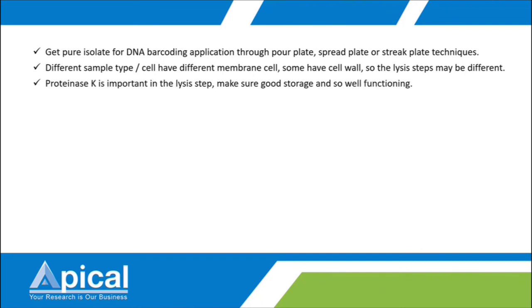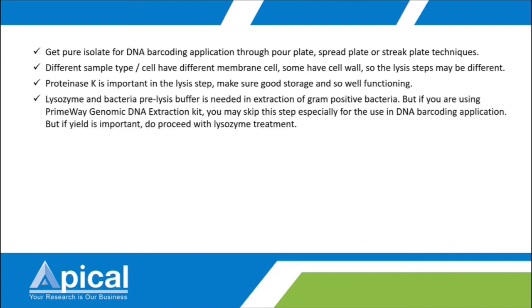Do make sure you use proteinase K in the lysis step, and also store and handle this enzyme properly, so it can do a good job for you. For gram-positive bacteria, lysozyme and pre-lysis buffer is needed.